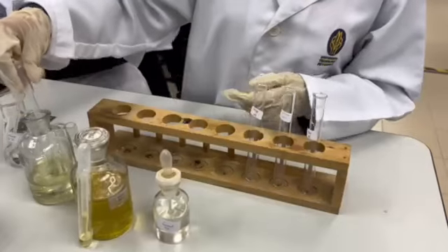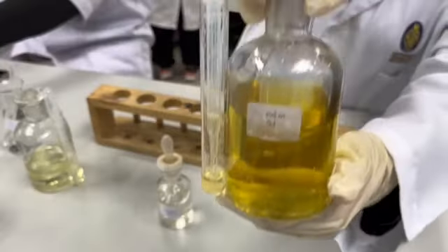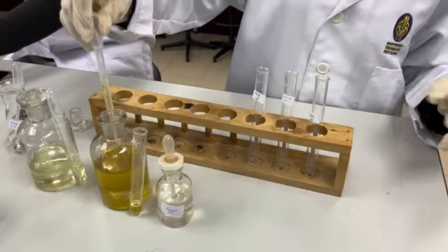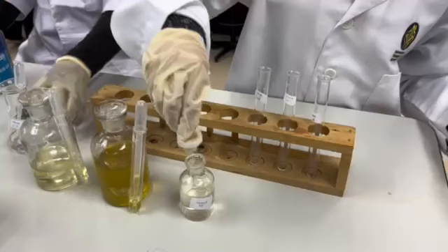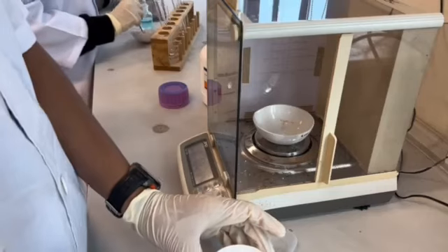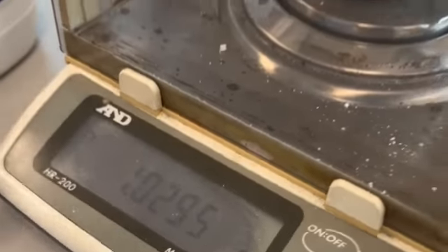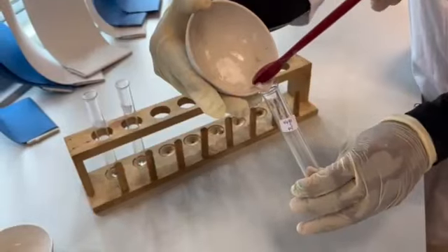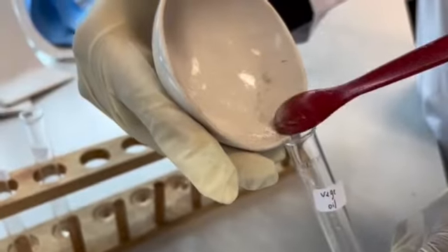Place 5 drops each of coconut oil, palm oil, and vegetable oil into 3 different test tubes. Add 1 gram sodium bisulfate and heat slowly using a Bunsen burner. Note the smell present and record the result.